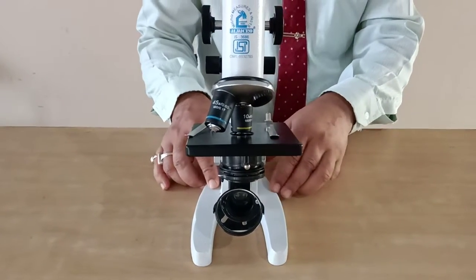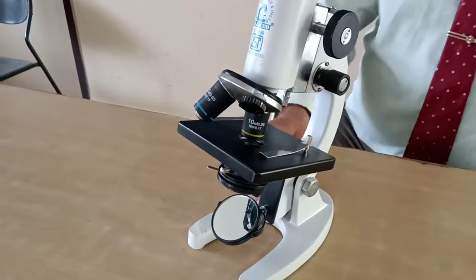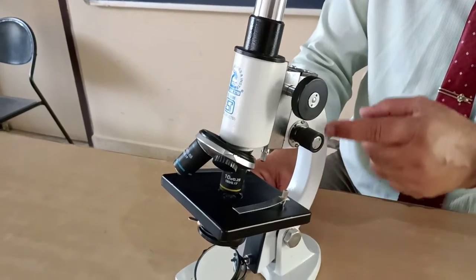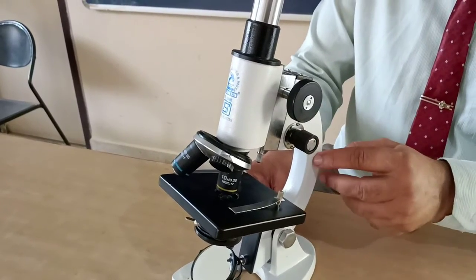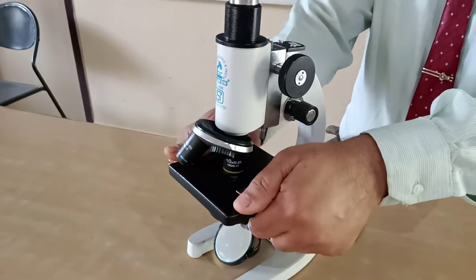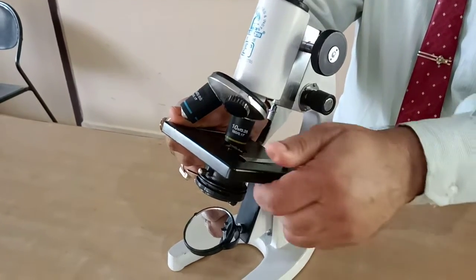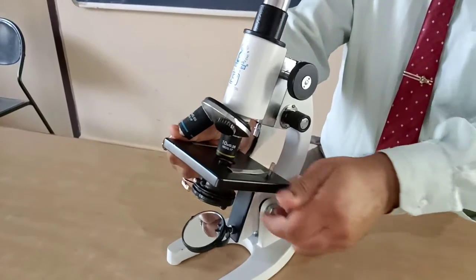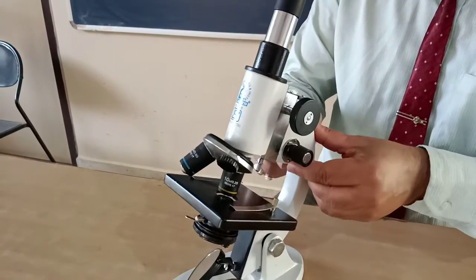Okay. Now this part is called arm. This is the arm of the microscope, the C-shaped arm of the microscope. So this is also movable or adjustable. We can adjust this like this. We can bend it or we can move it up from this point. From this point it can be moved up or down as per the requirement. So this is the arm. Foot and arm, two parts we have discussed.